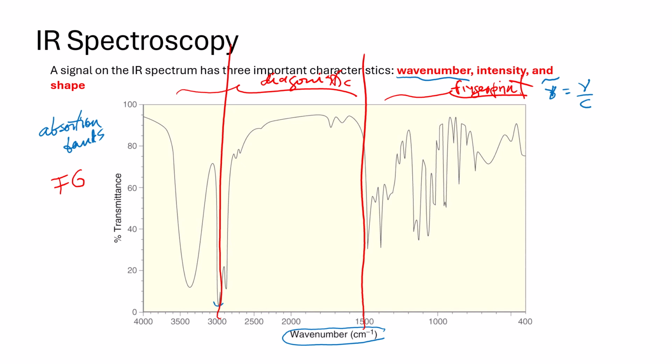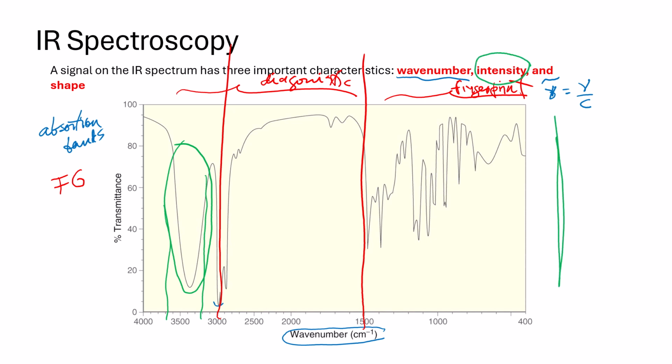Where are the bands? So this particular one is broad. That's an alcohol band. It is, say, starting at 3200 up to 3600. So that's what we say the wave number. Where is the band? Then we're going to be looking at the intensity. There will be bands that are large, so a lot of absorption, and some that are small. And the other factor is shape, so whether the band is narrow or broad, like that. Because those are important characteristics that will help us determine functional groups.